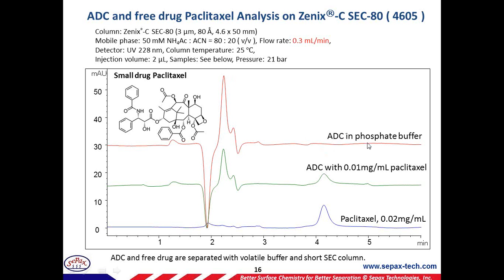And then sometimes people do 2 drugs per molecule, so depending on different hydrophobicity of the small molecule, it can be well separated on the one column as well. With the quantitation, you actually can do a standard curve using the small drug, different concentration or different amount of injection, generate a standard curve, and then you can calculate how much of the residual drug is still present in the sample mixture. All right, so that's very quick and easy.